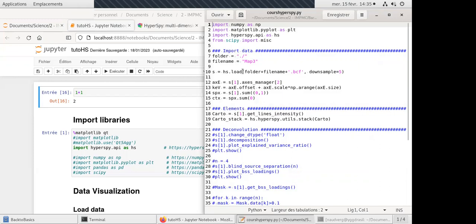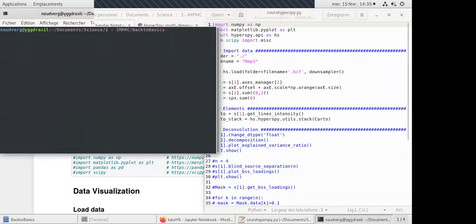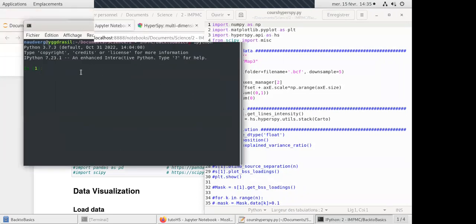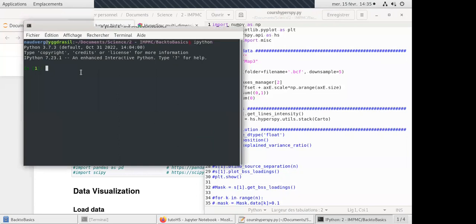You write everything you want to do and run it with a terminal. Most of the time I use IPython. When you have Python, you have basic functions like addition or other operations. One thing that leads to Python is the use of lists — you can create a list.